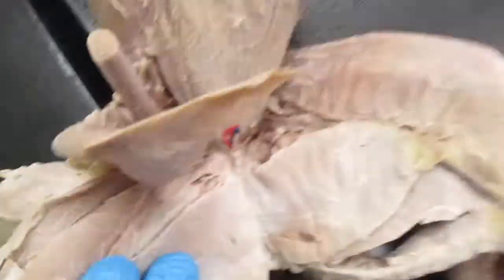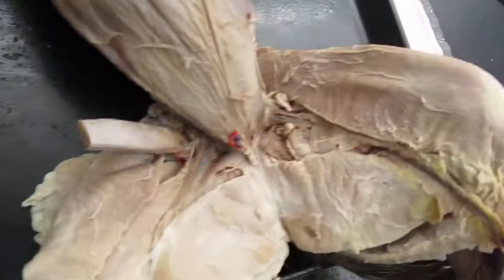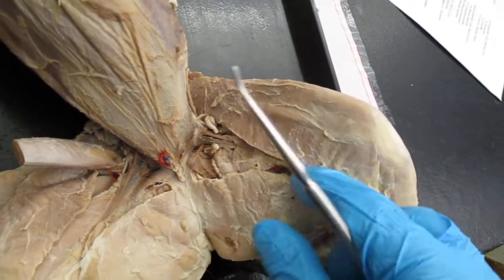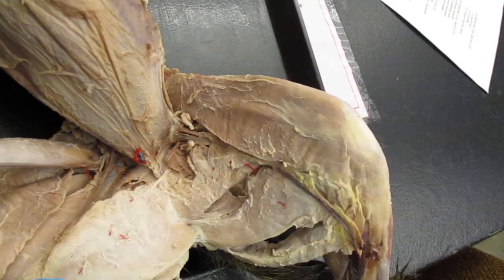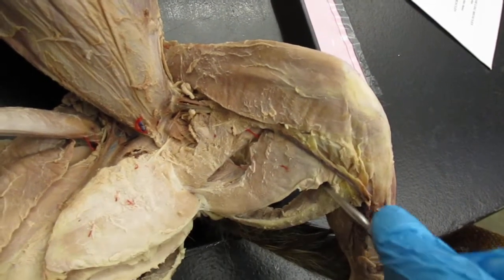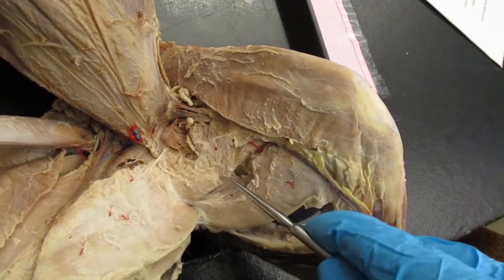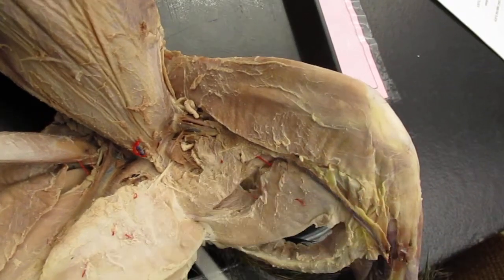So let me show you this on this cat here. So again, we can see, let me move this cat around and show you. So here we have the sartorius, gracilis, and then your semitendinosus, semimembranosus, and then the adductors and pectineus will be right in there.